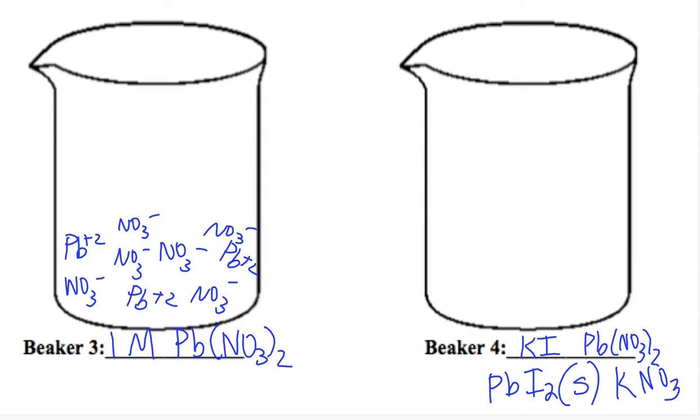I don't want to fill it up too much, but all right. See that? Okay. Will it light up? I made a solid. Will it light up? Are you sure? Why is it lighting up?